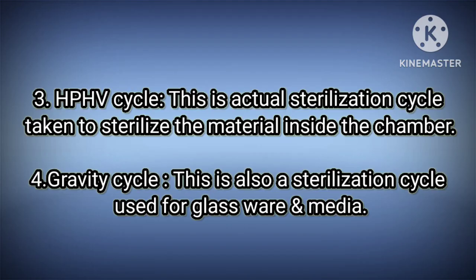HPHV cycle. This is actual sterilization cycle taken to sterilize the materials inside the chamber. Gravity cycle. This is also a sterilization cycle used for glassware and media.